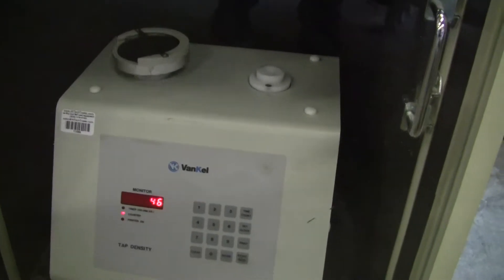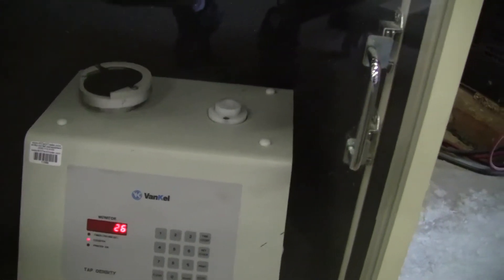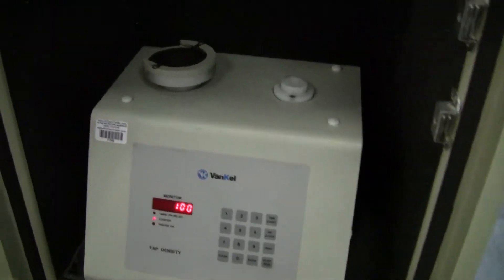You can see, with the door closed, it's obviously much quieter. Count it down from 100.